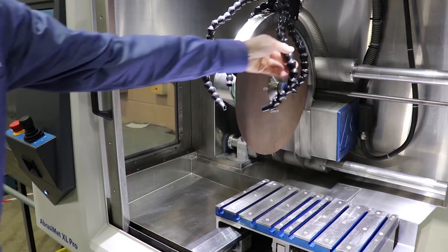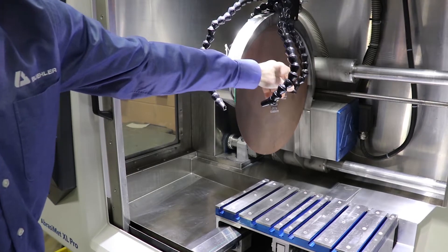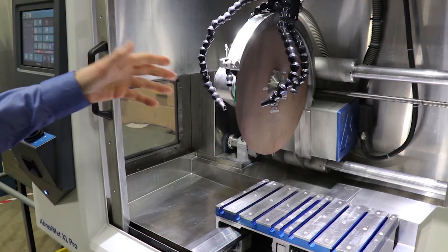We've got coolant here — it's very easy to position coolant exactly where you want it, either on the blade or on the part.